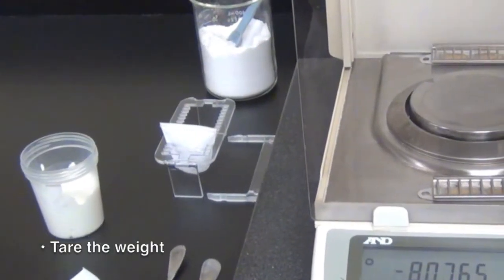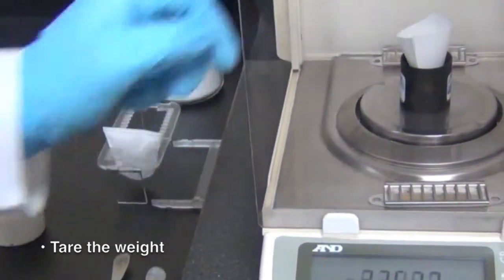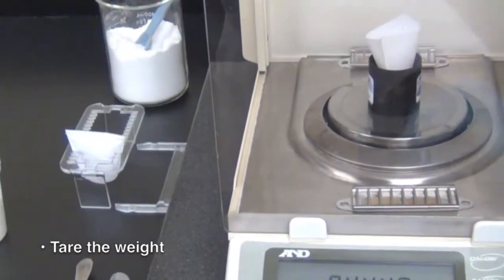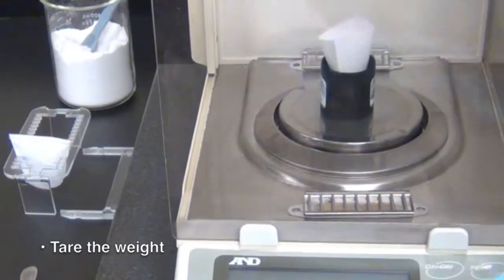After the weight of the bag has been recorded, put the bag in the bagway holder, place it on the balance, and zero the weight.